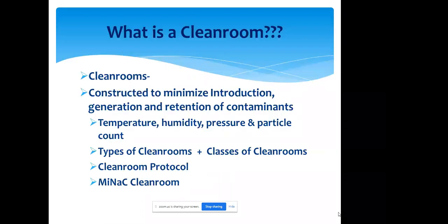So I talked a little bit about clean rooms, and about the types of clean rooms or classes of clean rooms. I'll go back to the types of clean rooms. You can have one big giant room with equipment that you do your processes on, and then you also have supportive equipment, like your gas cylinders, your chillers, your little pumps. All those are in one big giant room. We call that a ballroom design, where everything is in one room.